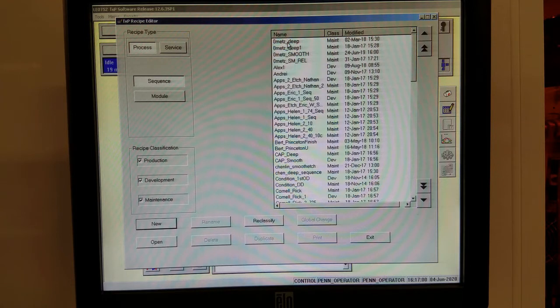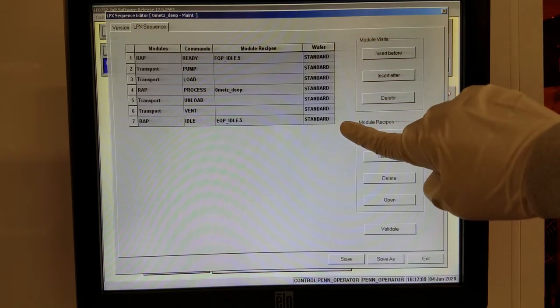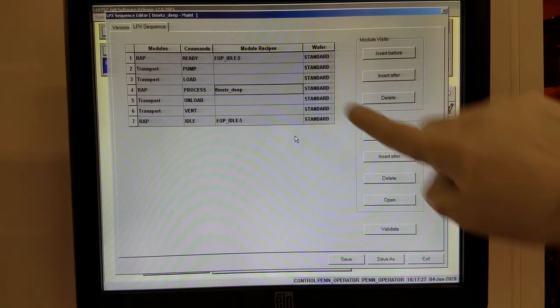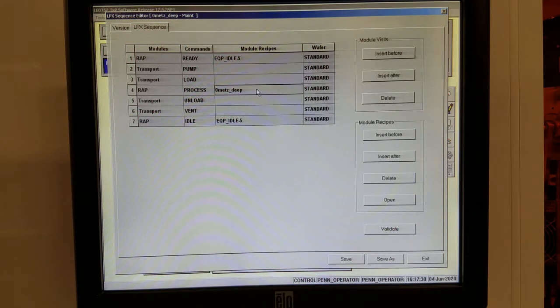Let's look at an example. Let's take this sequence called ZeroMetsDeep and open it. You'll see here what it contains: idle the chamber, load the wafer, run the process, and so on. We need to adjust the parameters of this recipe, called the ModuleRecipe, which is the etch recipe that the tool will actually run on the wafer. For this example, we'll set this ZeroMetsDeepRecipe to run for 50 loops.